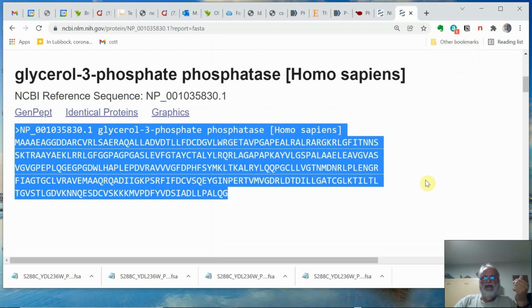Hopefully this will get you started with sequences, and I'll create another video with more detailed aspects of assignment 1. In assignment 1, we're going to be doing another alignment of these 2 proteins. Then we'll get that set up, and we'll create a figure showing the alignment of the DNA and the protein sequence and that sort of thing.